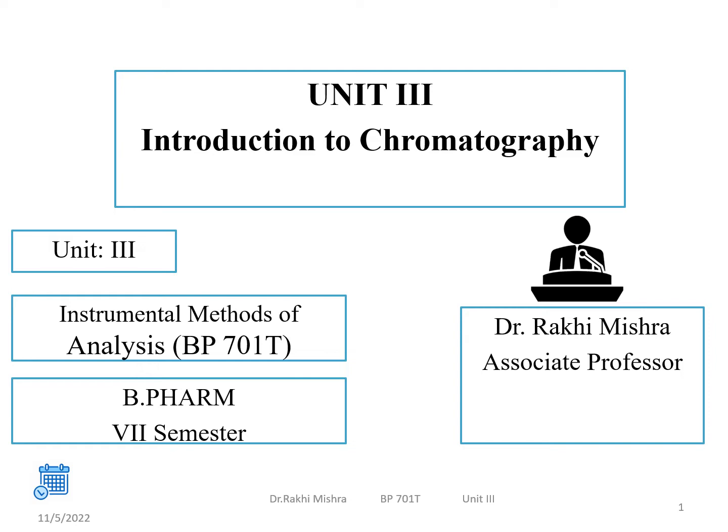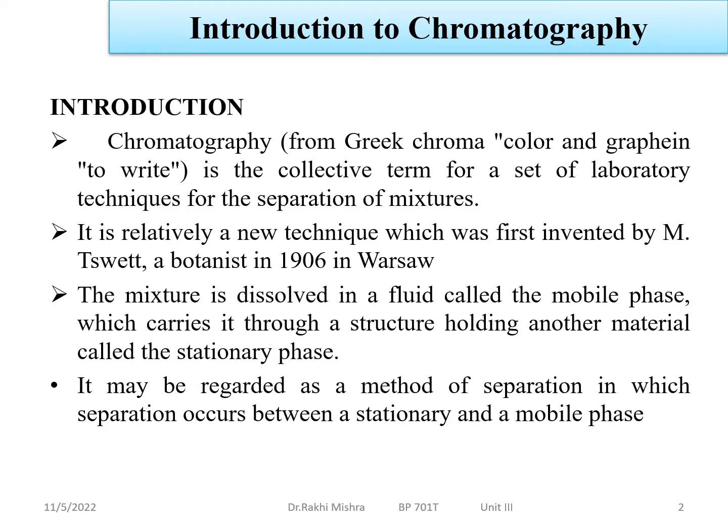So today in my first lecture, I will discuss the chromatography technique. When we talk about chromatography, we come across various terms such as thin layer chromatography, HPLC, column chromatography, and ion exchange chromatography. But before going into detail with each type, we must be familiar with the term chromatography. So what is the meaning of chromatography?